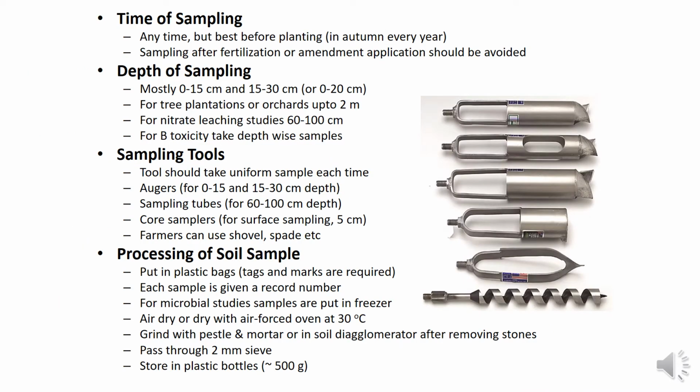As for the time of sampling, soil samples can be taken anytime that soil conditions permit, but sampling directly after fertilization or amendment should be avoided. We must be very careful while taking the sample.